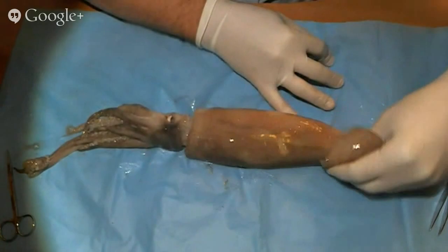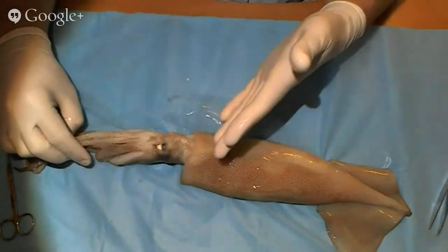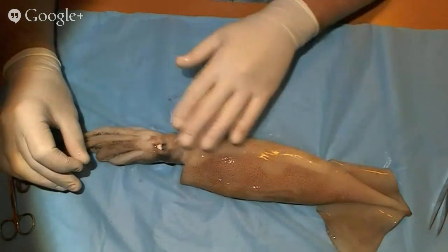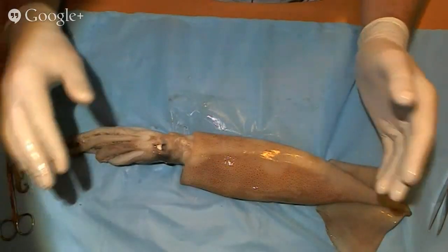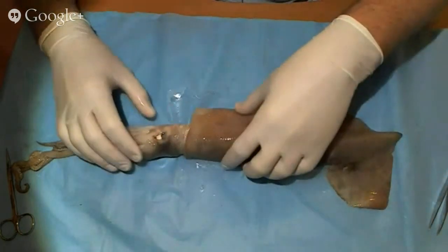On the bottom, or the ventral side, you're going to notice that it's lighter in color, and if a predator was looking up into the lighter colored surface or up towards the air, then they would see lots of sunlight, including a lighter color of the squid, so it's less likely the squid is going to be eaten or seen by its predators.